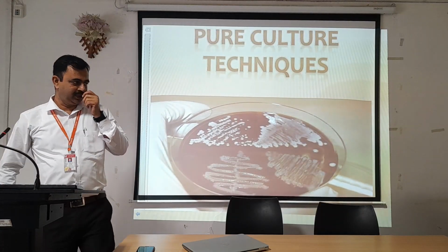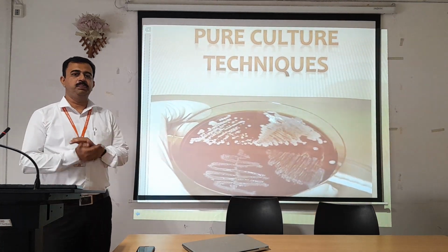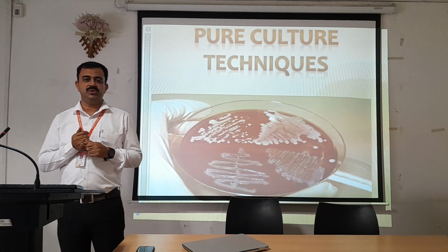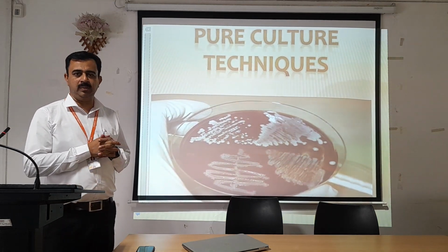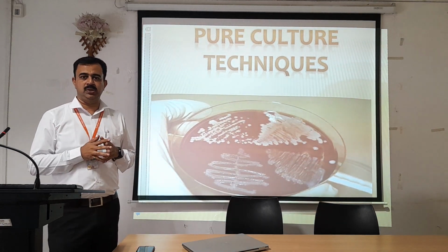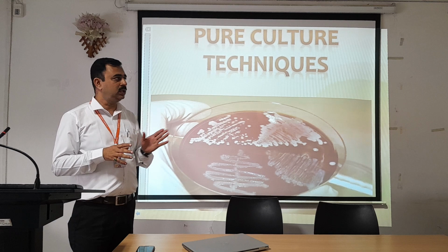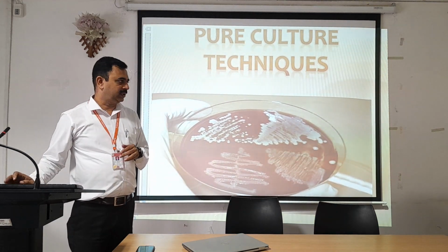Today we are back after the sessions and we'll concentrate on pure culture technique. Pure culture is a most important aspect of microbiology because in order to analyze any sample which comes into the microbiology laboratory, we need to compare that sample with the standard samples or standard microorganisms that are present. So, in order to isolate the organisms from a group of organisms, we need such techniques, which are called pure culture techniques.